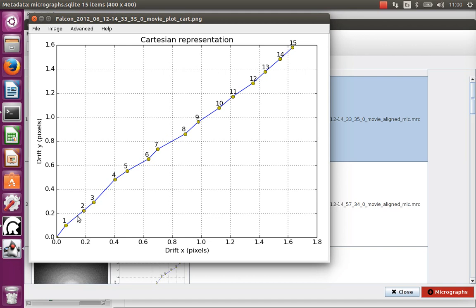And remember that this is local movement, so each location may move independently from the rest with some regularization, which means relatively smooth movements, but they can move in different directions. What we are representing here is the average of the absolute value of the movement.